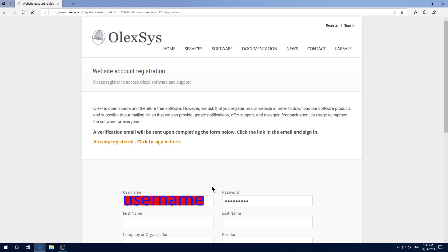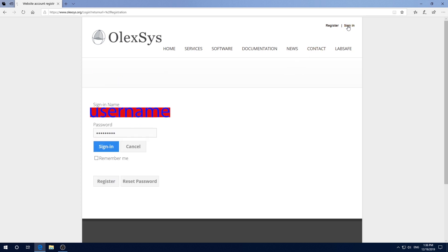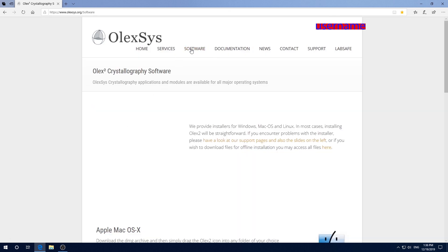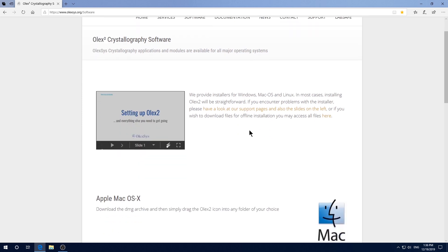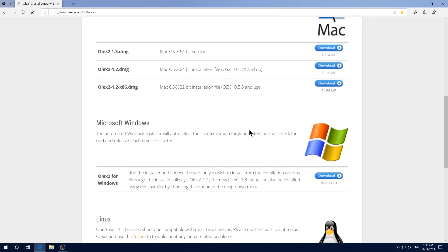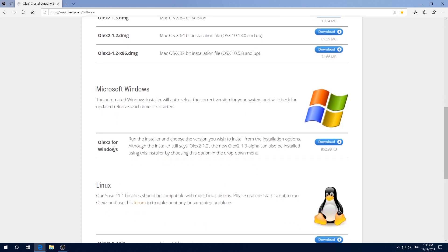After registration, come here to sign in. Then click software on the top of the page. Then scroll down to find the version for your operating system. I use Windows, so I click this to download.